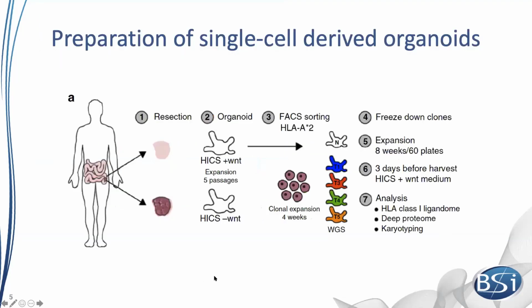This paper involves samples or biopsies taken from a single patient. They took tissue biopsies from both normal colon tissue as well as a colorectal cancer tumor.